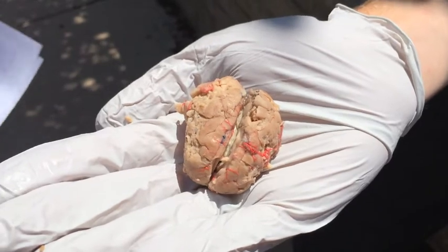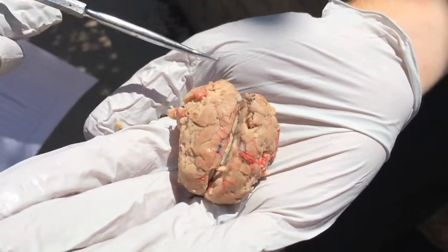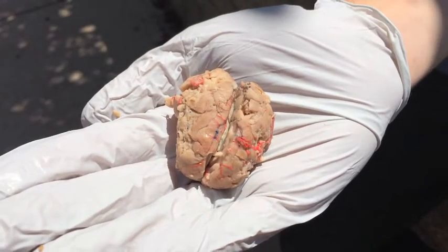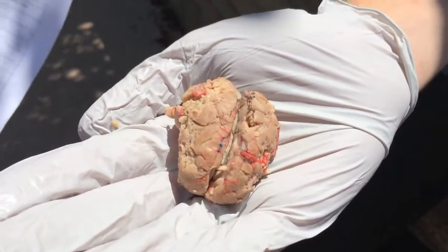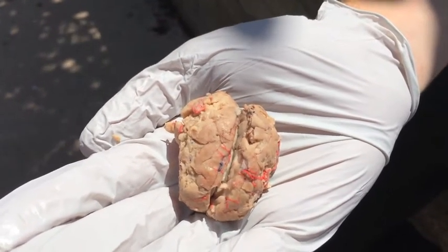Okay, so here we have our pig's brain, and the first thing I'm going to start with is the meninges, which is basically behind the brain, at the brain stem and the spinal cord. And basically what it does is it protects and insulates the brain stem and the spinal cord.